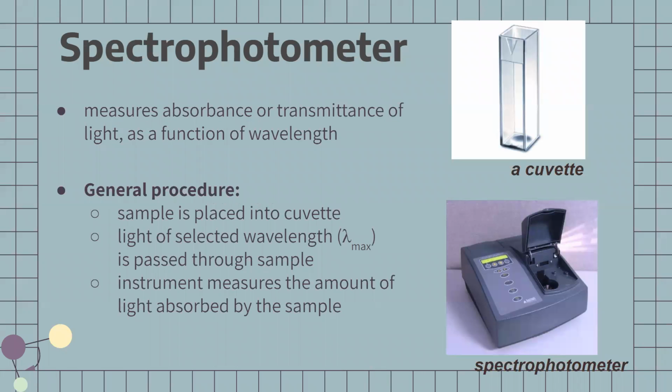Now, how do spectrophotometers work? So if you were here on Monday and Tuesday for the lab, you probably recall my rant about how terrible our spectrophotometers are. But newer ones look something like you're seeing on the right here. They have a place to put a cuvette, which is this little square thing, and light can pass through the clear sides of that cuvette.